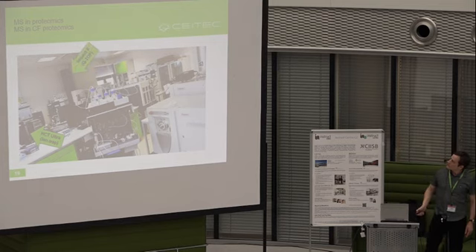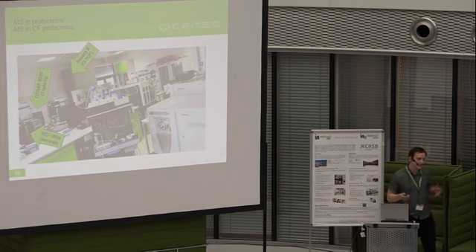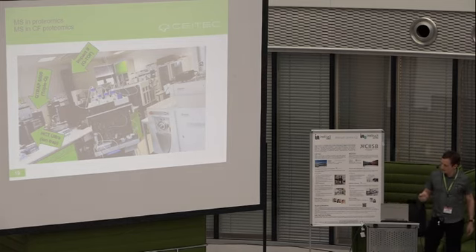This is a QTOF, which is excellent for larger peptides. This is a triple quad for targeted proteomics. That means that you know what you're looking for, so you tune the quadrupoles in the mass spectrometer to obtain the signal of the peptide of your interest with the highest quality, and you can then quantify it.